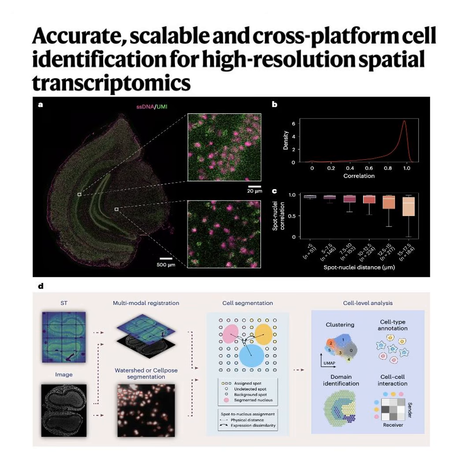The second camp approaches it from the exact opposite direction. That's barcoding-based ST like Stereo-seq or Seq-Scope. Okay, so instead of searching for specific glowing genes. Right, they lay down this dense microscopic grid of DNA barcodes on a physical slide. You place the tissue on the slide, and the barcodes act like a sticky net. Capturing everything. Exactly, capturing the entire transcriptome, every single gene being expressed across that tissue.